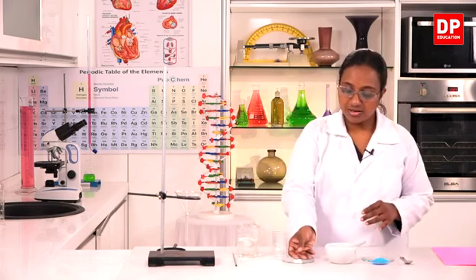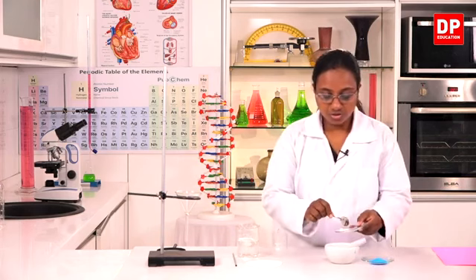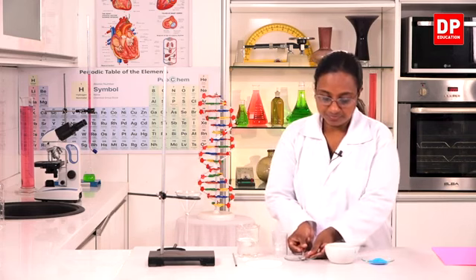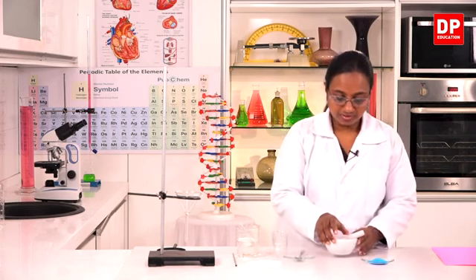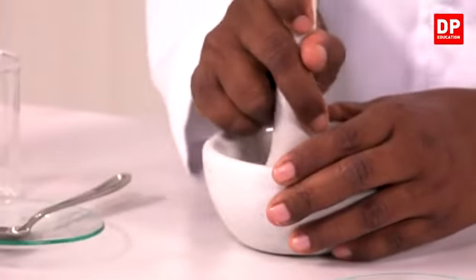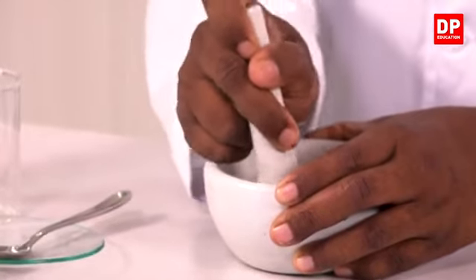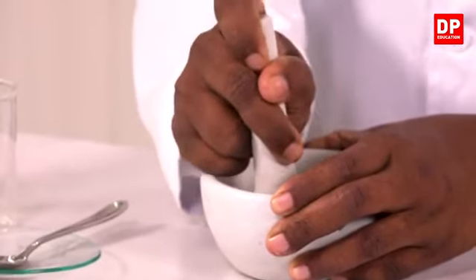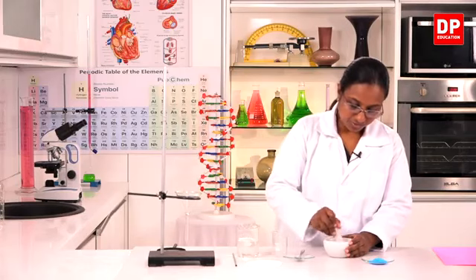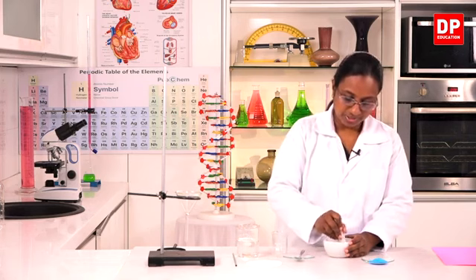So first I will have to transfer the naphthalene balls into a mortar and pestle, and then I can grind it together. Grind it, or if I just press it itself, I can get the powder because it is a soft ball. We can easily powder it without any problem.